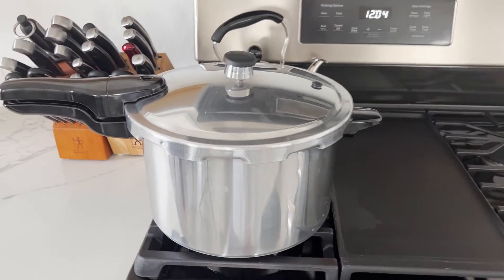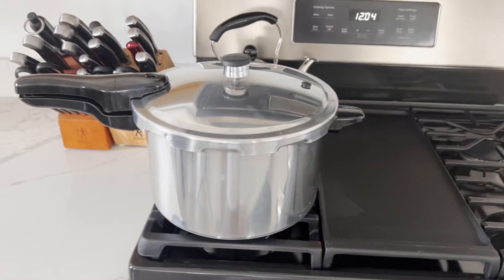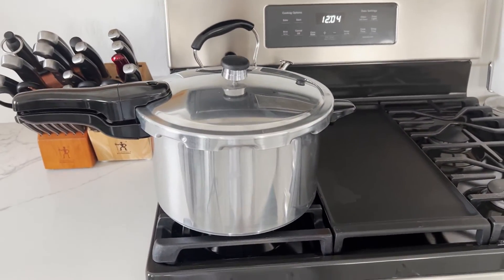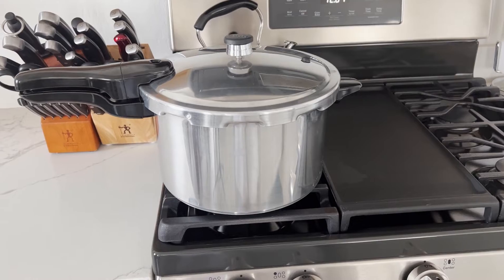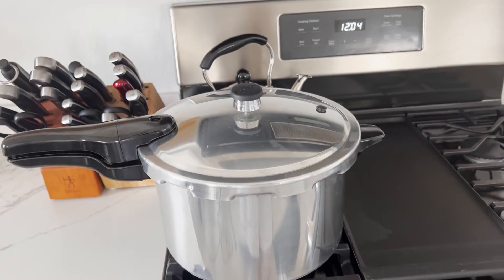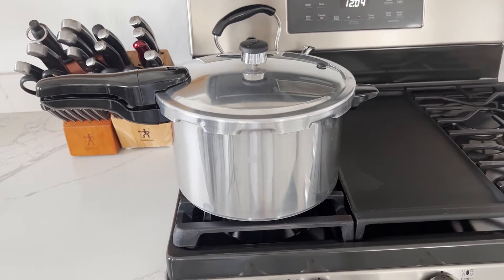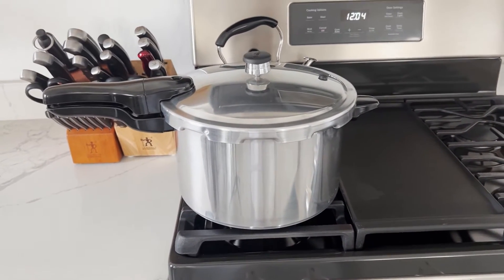After 45 minutes we're going to turn the heat completely off and let it come down to pressure on its own. If I was in a hurry I'd remove the rocker and it'll steam off a lot quicker, but I'm not in a hurry so I'll just let it steam off slowly.